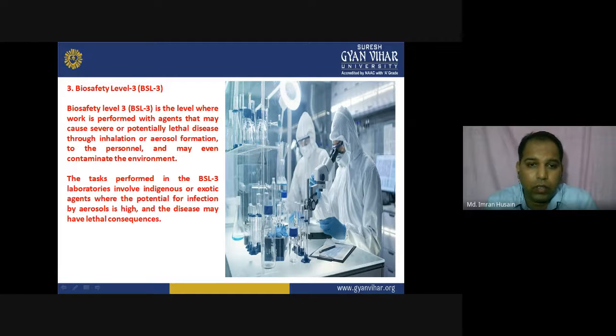The tasks performed in BSL-3 laboratories involve indigenous or exotic agents where the potential for infection by aerosol is high and the disease may have lethal consequences. You must understand the real meaning of the terms indigenous and exotic. Indigenous means native.